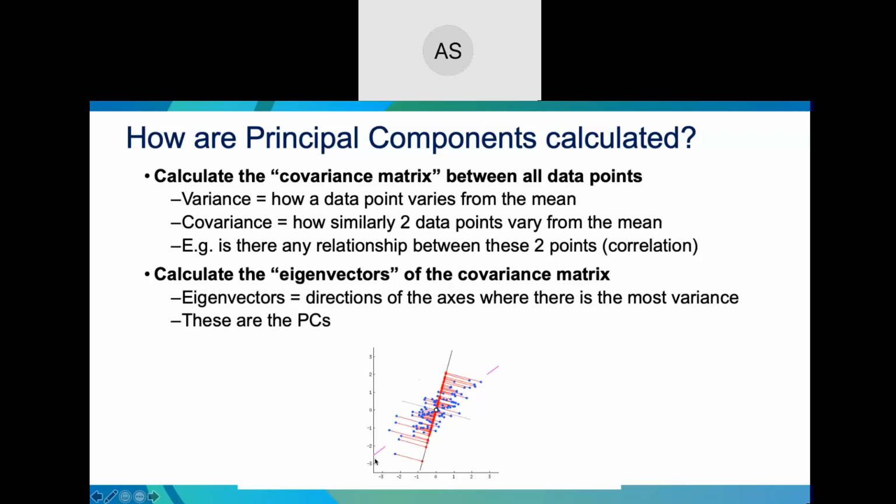So in order to capture the most obvious variance with the first principal component, this eigenvector will stop right here where it matches these two purple lines, and that will capture the most variance. And then the second principal component always needs to be perpendicular to the first principal component, because of the assumption that generally if there's a lot of breadth, a lot of distribution in one direction, there's also going to be some distribution in the orthogonal direction, but it's going to be less.